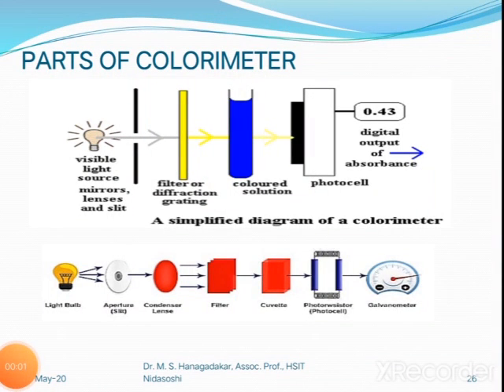Welcome back to the video lecture of module number 5, Instrumental Methods of Analysis. In the previous video lecture, we discussed Beer's law, Lambert's law and the Beer-Lambert law, and we saw how the Beer-Lambert law is used for the measurement of the amount of substance present in a colored sample solution.